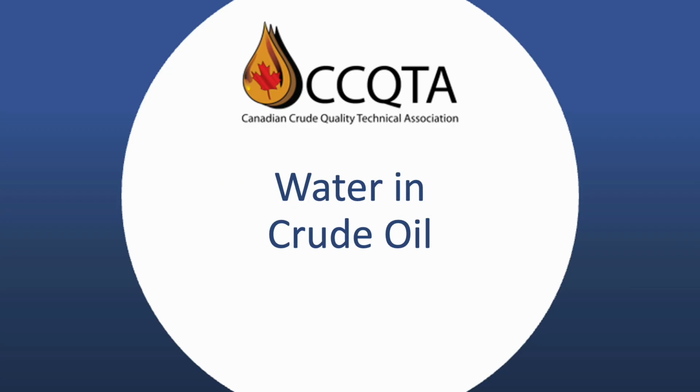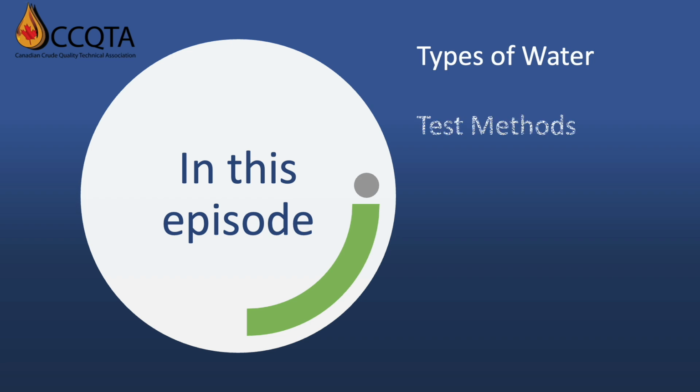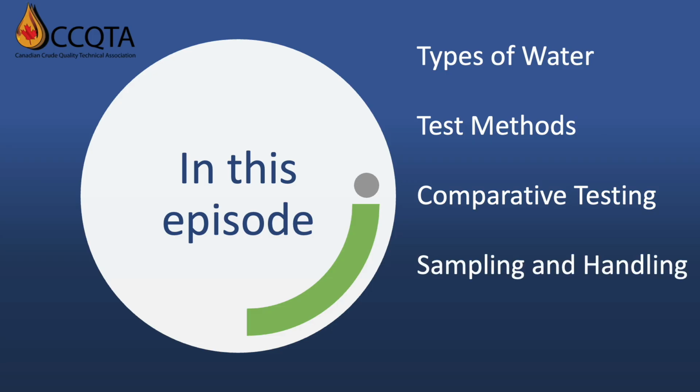This episode will focus on water and crude oil. In this episode, we're going to focus on the following. What are the different types of water when we're considering the water content of a crude oil? What test methods are employed, including their capabilities and limitations? Some comparative testing and how different test methods can yield different results on the same sample. Then a brief discussion on sample handling. And then finally, choosing methods that are fit for purpose.